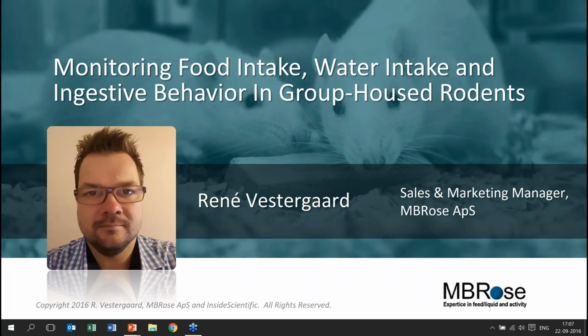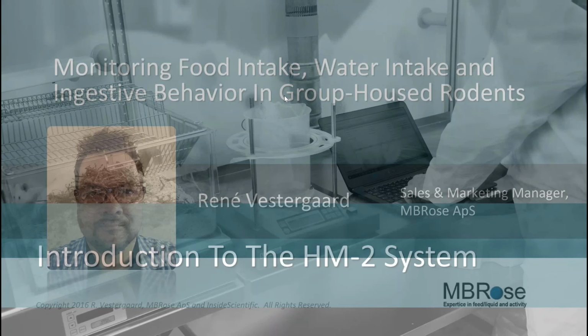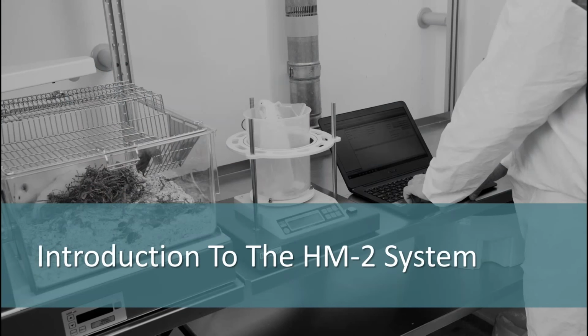Okay, and thank you all for participating in this webinar. I will jump right into it. So, the introduction to the HM2 system. This is for giving you a ground-based understanding of the system, so you better understand what Mas and Niels are talking about and where they get their data from. So, I will go on.